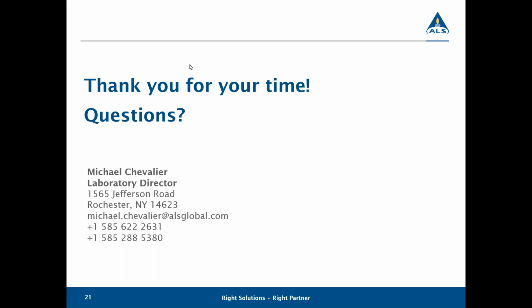Keith would like to know, sampling of dissolved metals was mentioned. What about total metals? Yes, so the RPP sampler is only able to be used for dissolved metals. We do not currently have a passive sampler that can be used for total metals.